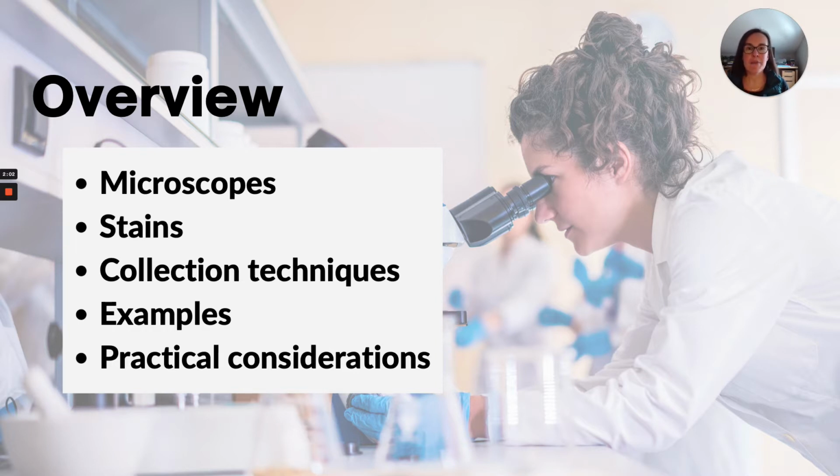So we will definitely bring in more about how to read our slides if that's interesting to you. But in this lesson, I really just wanted to get you information about what kind of microscope I should have, how I actually stain my slides, and how I set this all up and get the best sample. Sampling is a huge concern for some people, and I want to make sure you're really on board with how to do your sampling.